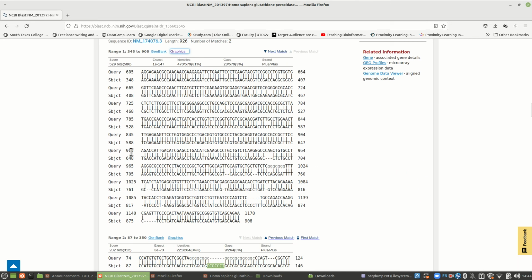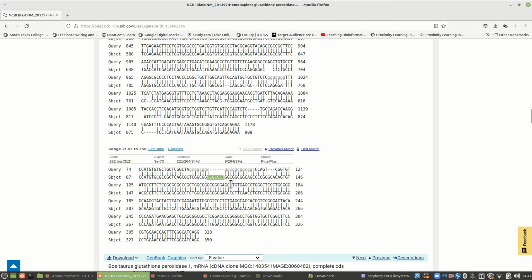So on this one, we were looking at this, and we see these pieces cut out. At this point, what you would do is look for things that are odd, all right? Now this is still the same. These are mismatches. See, there's some places missing, and the sequence is a little different.